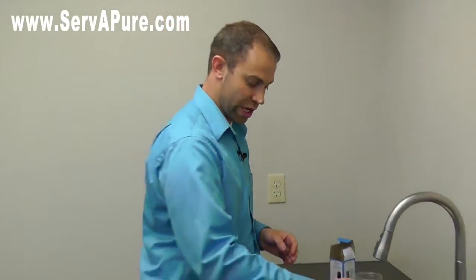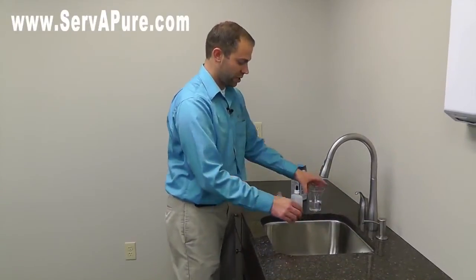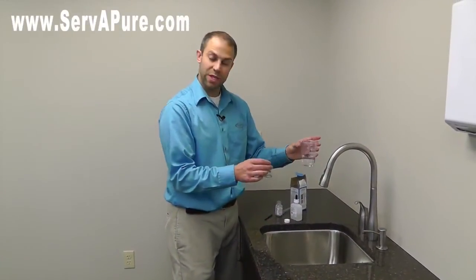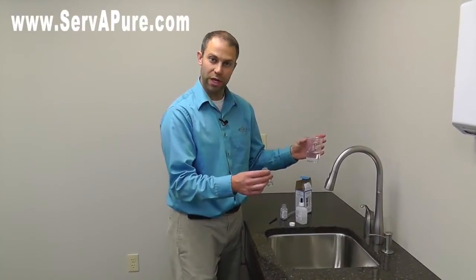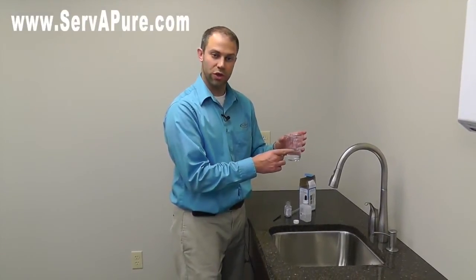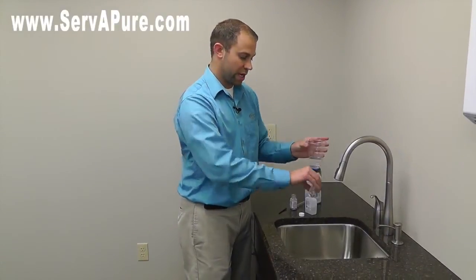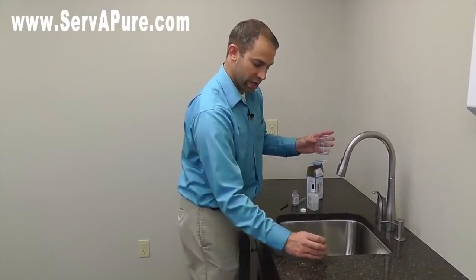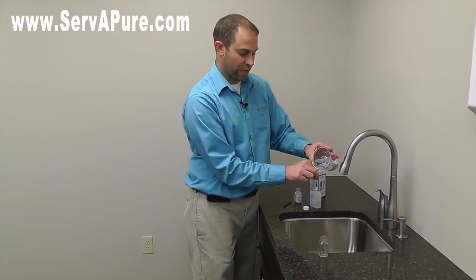Now if you wanted to actually check hard water, I have a sample of that here too. You can sometimes get this on your outside faucet if it's not connected to your water softener, or if you're putting in a new water softener this would be just your regular city or well water. You can rinse out the jar that you have, make sure we get it good and clean — same thing with the little sample vial.